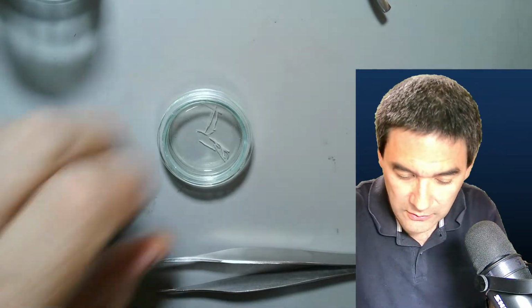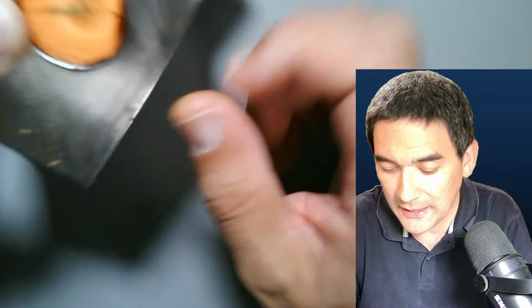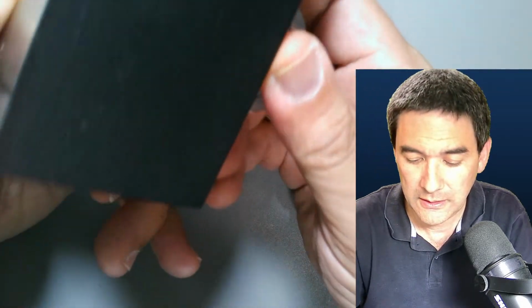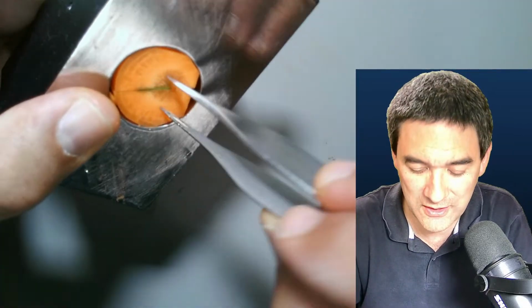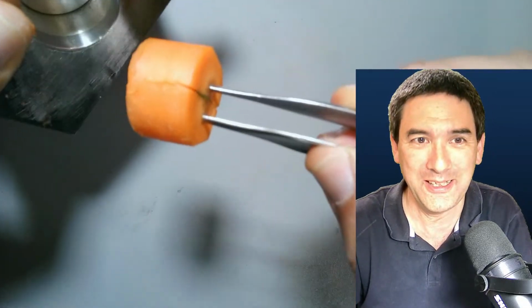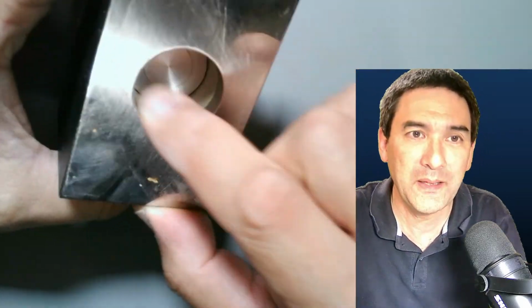I would like to do a little bit of cleanup first, because I do not want any of the other camera equipment to become soaked in water. I will also remove this here. Before I do that, look, how do I get it out? Of course, I can turn it and slowly advance it out, or a second possibility is taking some tweezers and lifting it out like this. So that's the way it goes. And I'm going to go to a hardware shop and get myself a puncher.